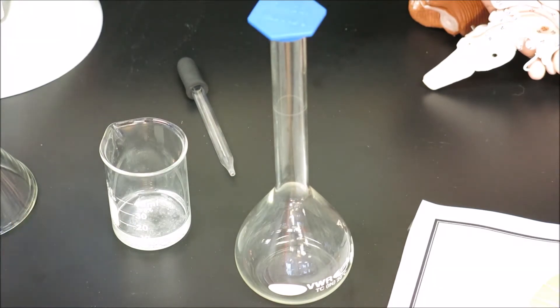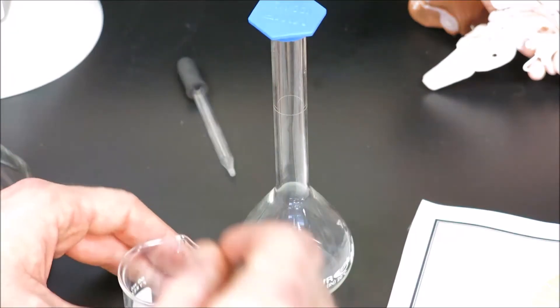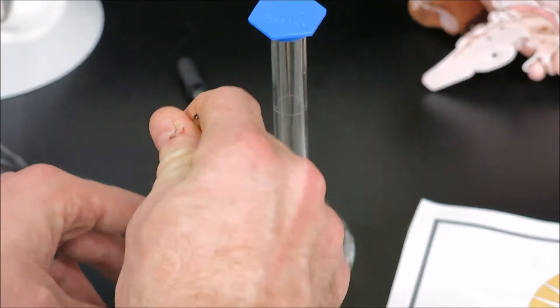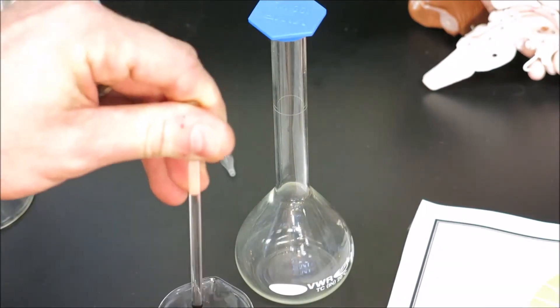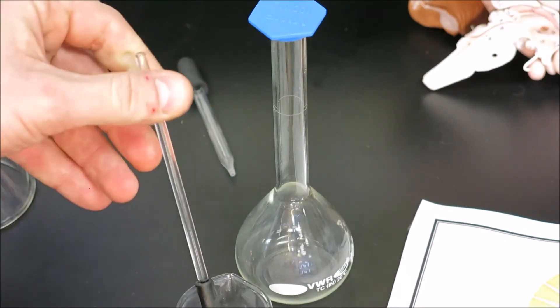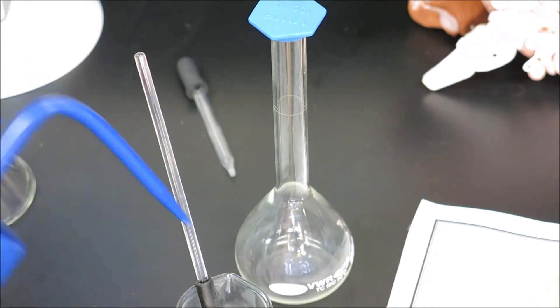Once that is finished, our weigh boat is clean and all the solid is now in the small transfer beaker. We can stir that using the rubber policeman and add a little more water to help the dissolving process.